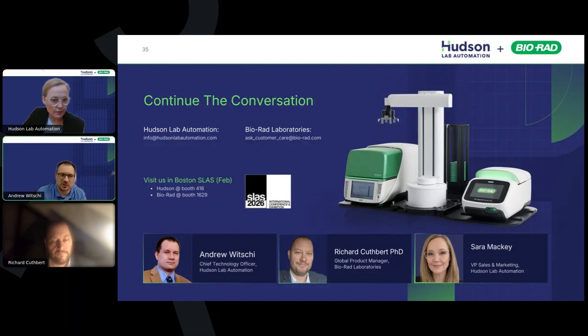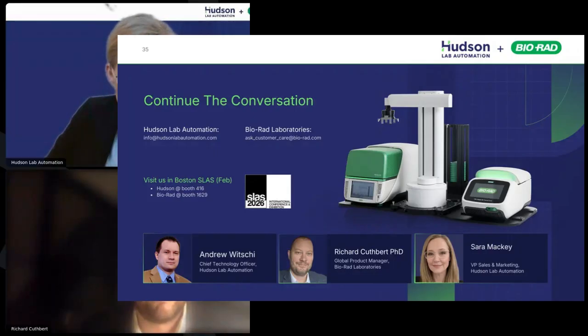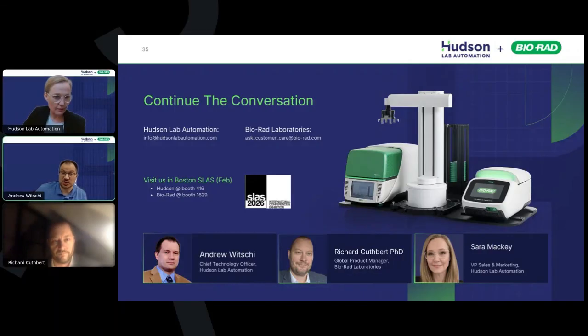So when you have an instrument like that, absolutely, one robotic arm makes a ton of sense, right? You can service a bunch because you're just trying to solve the problem of keeping those instruments busy when somebody isn't there. If you're trying to solve a problem where you have very precise timing constraints, sometimes sharing a robotic arm is not the right answer, right? Because from a flexibility standpoint, if you want to do a couple of different things on the system and you want to have very tight timing constraints, you may not be able to hit both of those requirements at the same time with one arm.